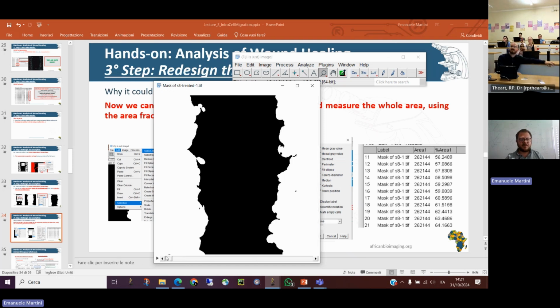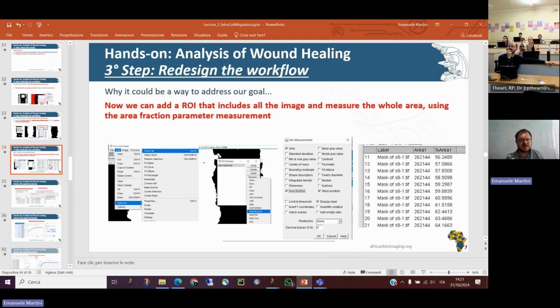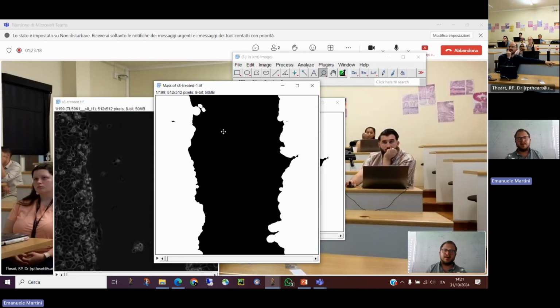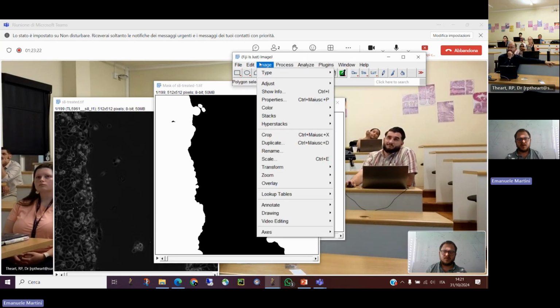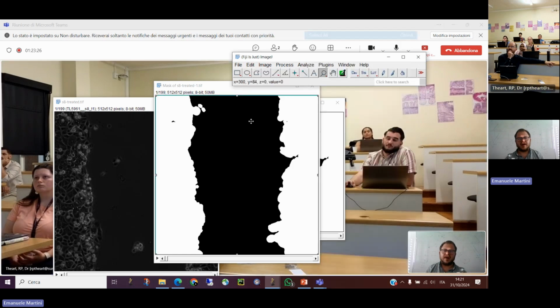To do it, you can do it in different ways. I will just show you one of them. Let me see where I put it. Okay, here. In the presentation, you'll find everything. What you have to do is select all the image. Where is it? It's Select All. So you want to do a selection of the whole image.